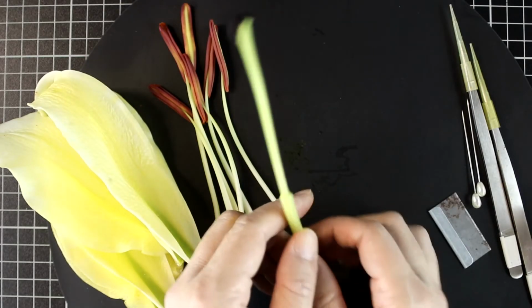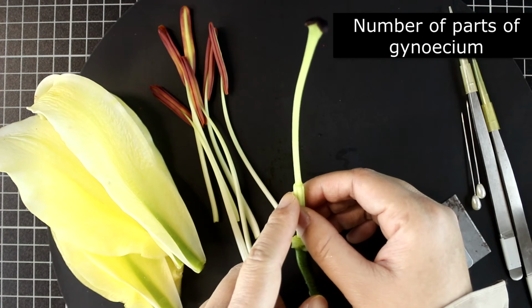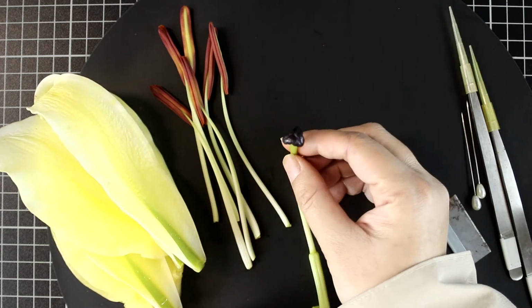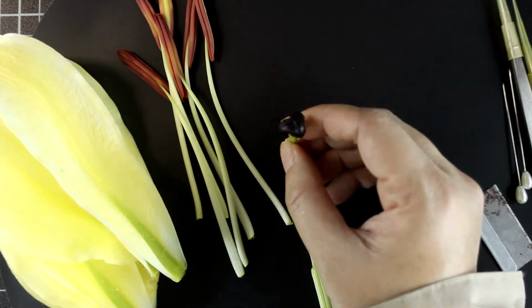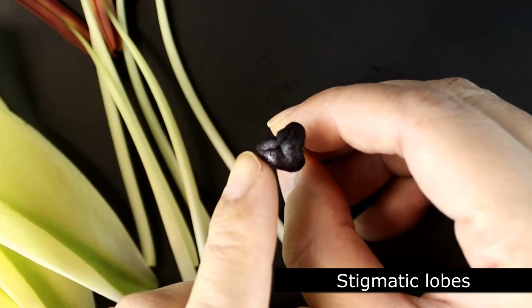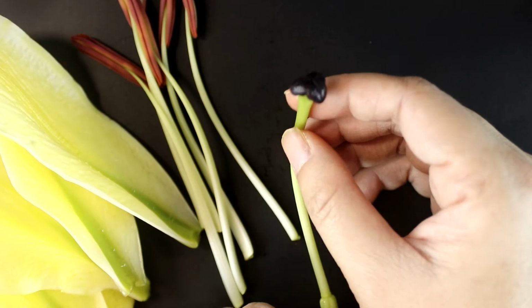So how about the carpel? How can we know the carpel number? We know there is only 1 pistil, but how many carpels are here? The first hint you can get is the number of the stigmatic lobes. So if we look closer, we find that there are 3 stigmatic lobes. So it could be 3.